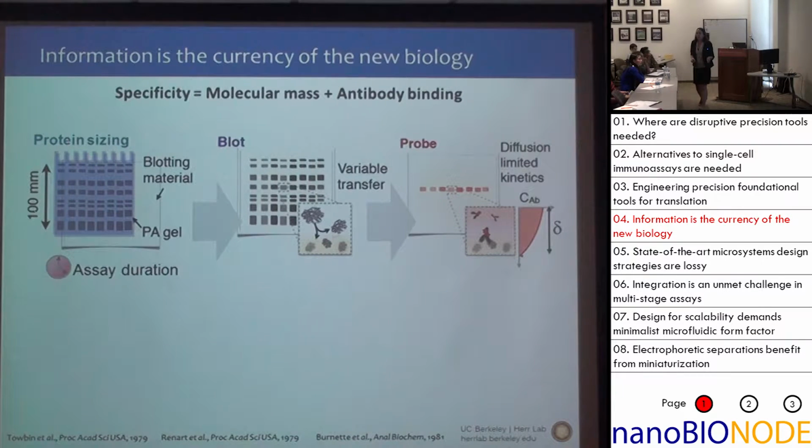If you think back a couple of slides, I talked about these truncated isoforms of HER2. You would imagine, if I'm looking at cells that have this P185 protein, I would have this one band here, let's say that's 185 kilodaltons. But I mentioned there's other shorter or truncated isoforms. Those would come in as smaller species down here, right? They would migrate faster through the gel.